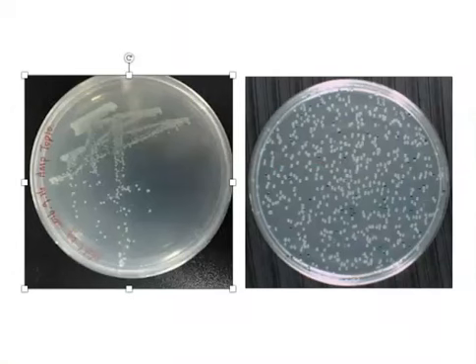When I use the word colony, I'm talking about one of these white spots here on this plate. Each one of these little white spots is bacterial growth. You're looking at what we call a spread plate. Now, this plate was made in the laboratory. A liquid sample or culture, either one would be fine, was placed on an agar plate surface and evenly spread all the way around the plate.